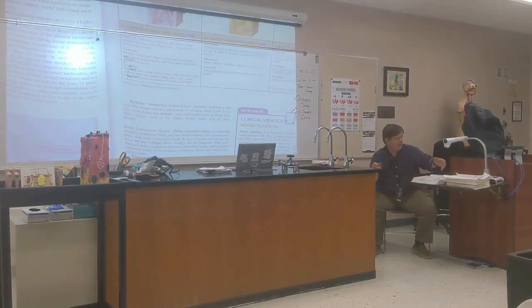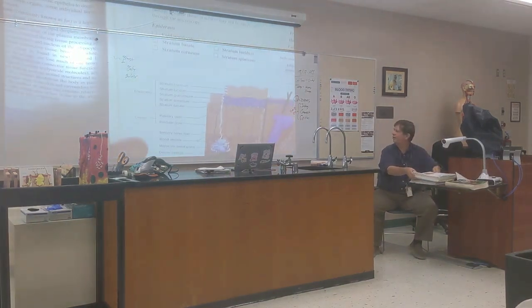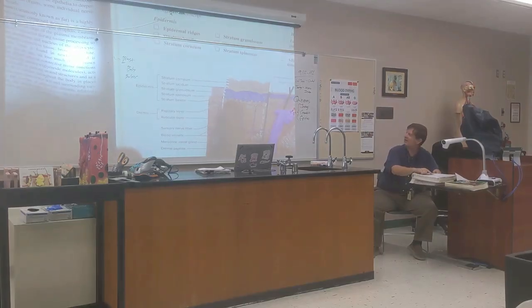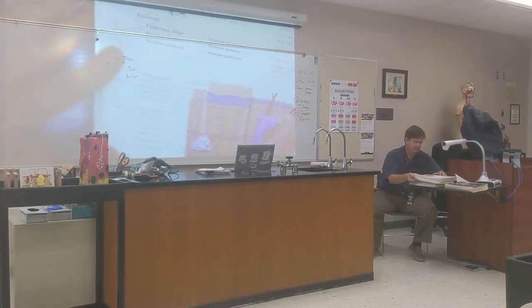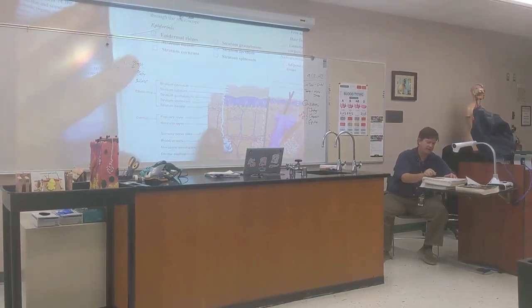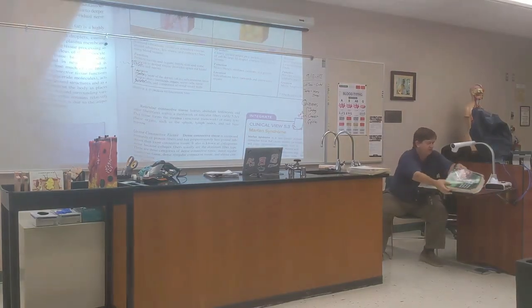Let's pull up your lab book again and show the picture. All right. So you can see the papillary layer is this little tiny part right up here where the dermal papilla are. Good? But that's not making me super happy. I'm going to go for the other book. But most of that is the reticular layer down here. Let's go for the other book that has a prettier picture, as it usually does.